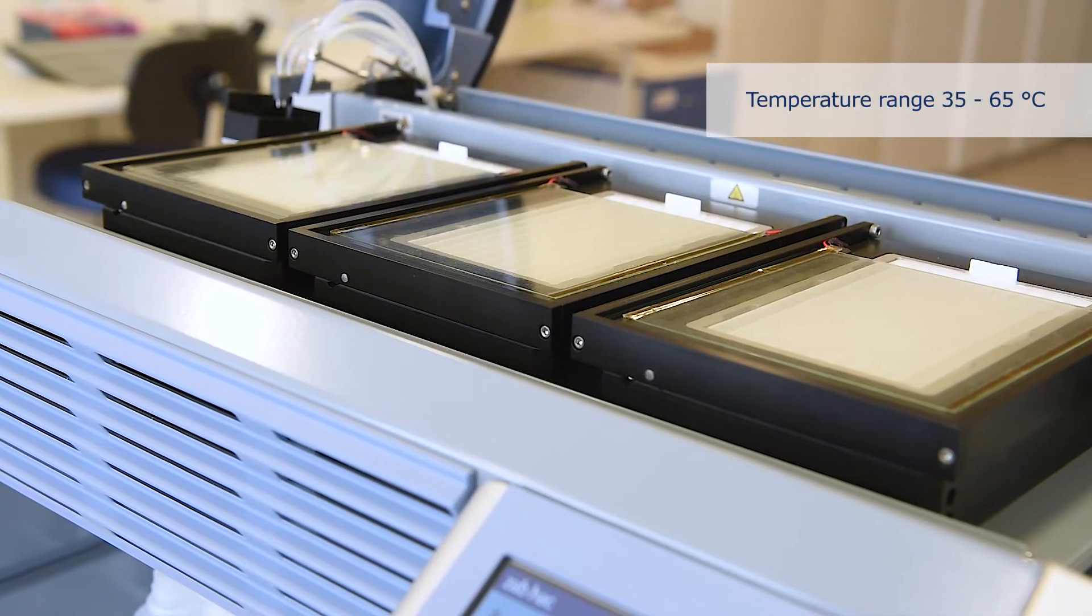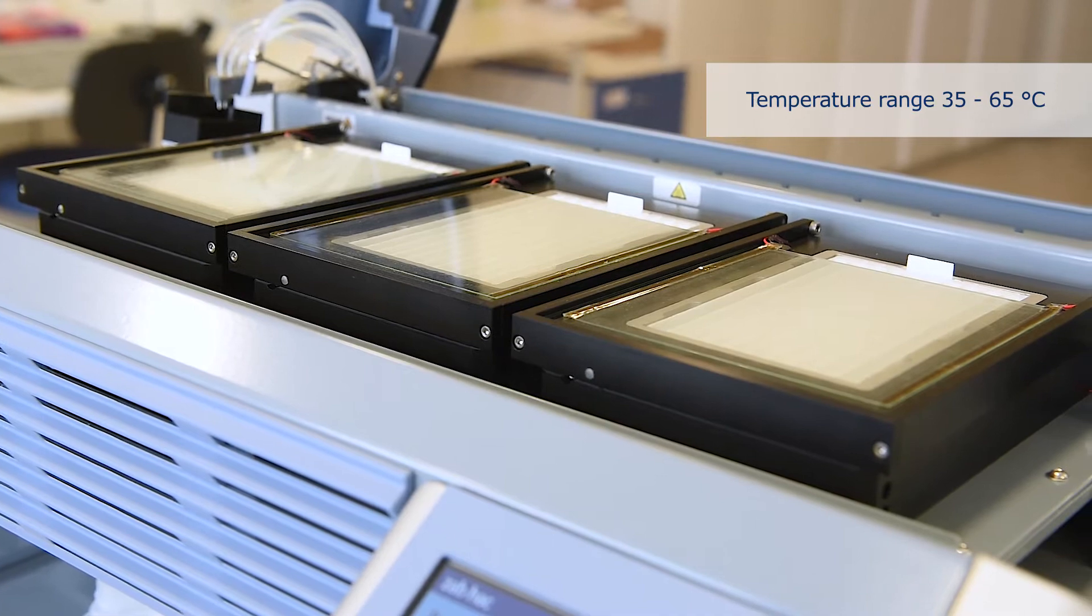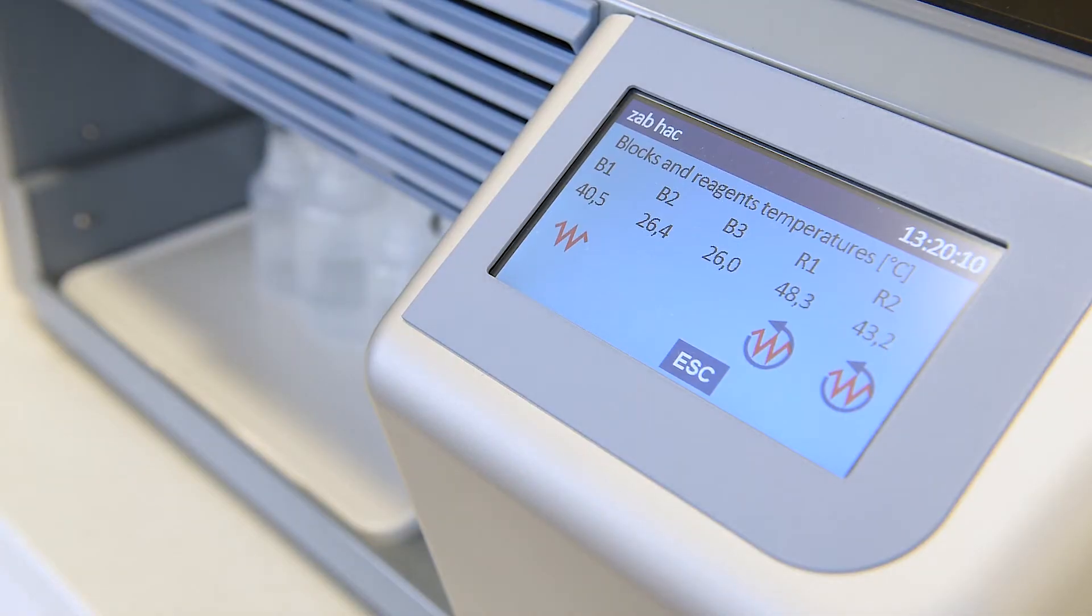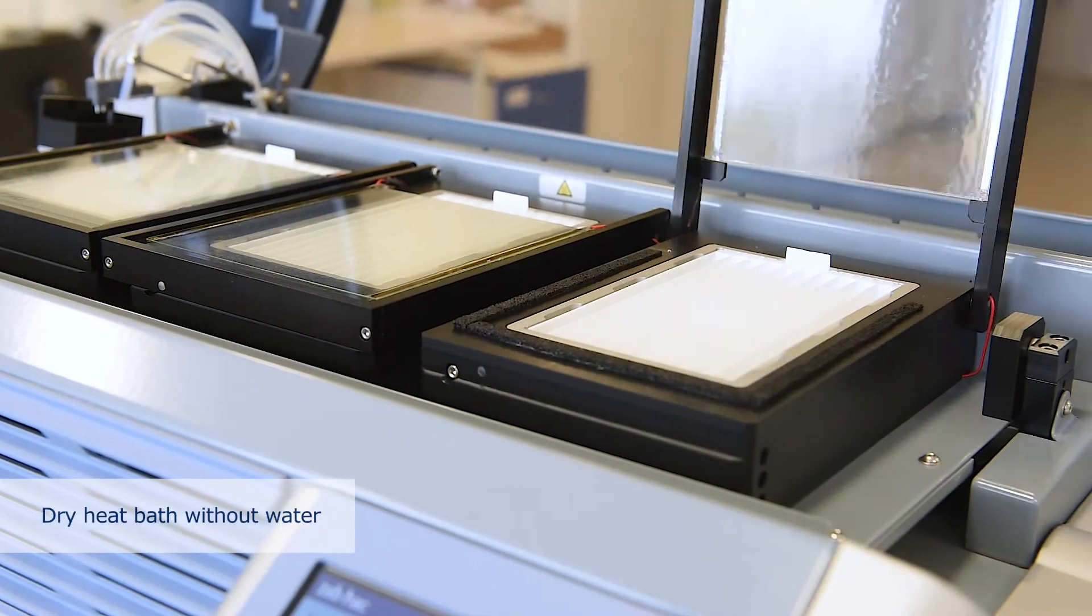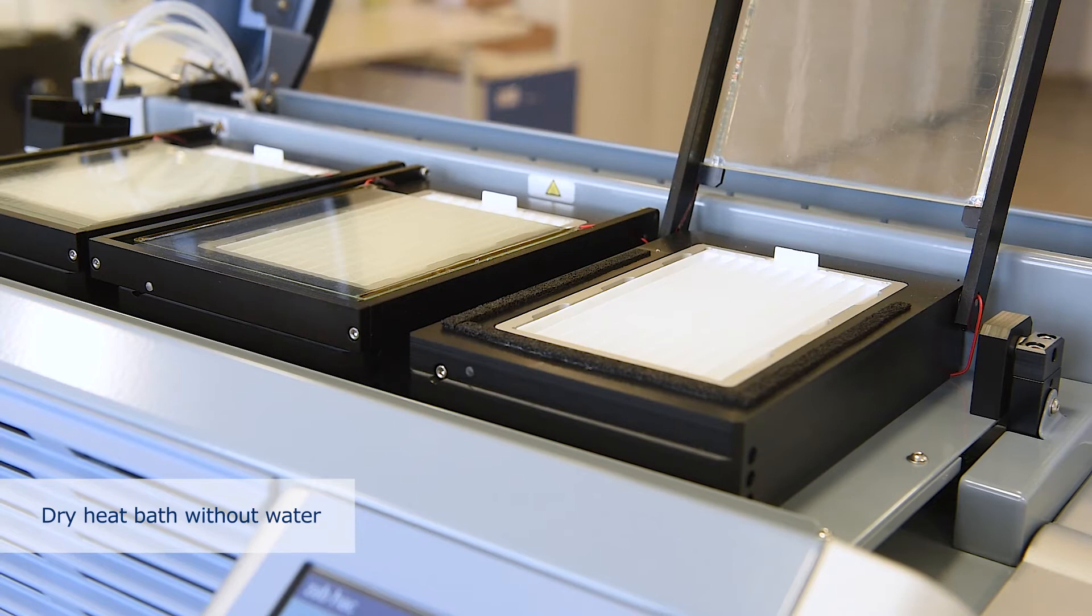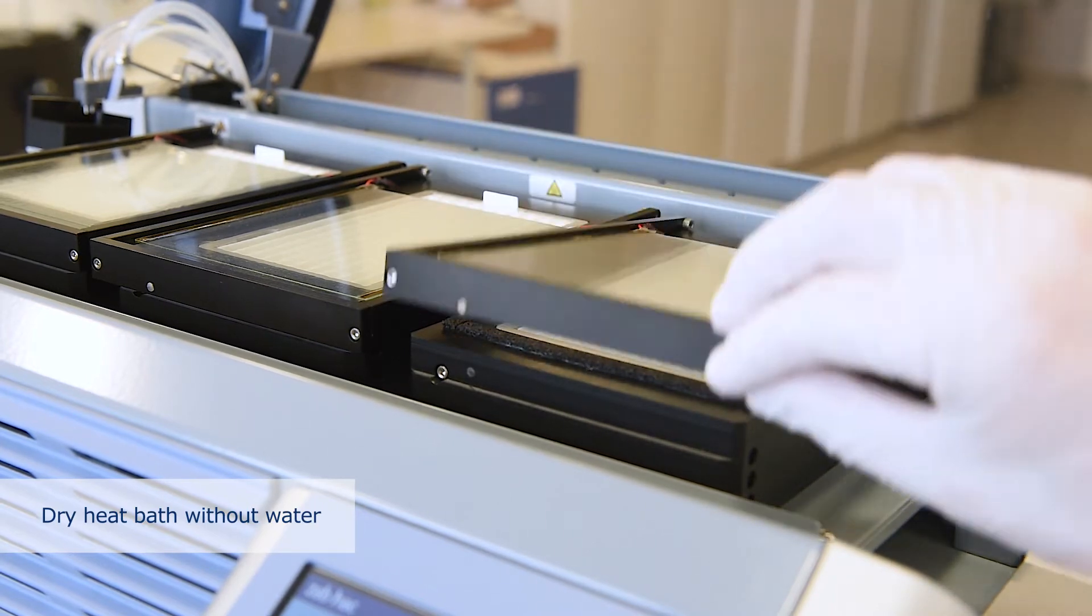As temperature control has key importance in hybridization assay technique, we've developed a sophisticated heating system which brings top temperature accuracy. It is based on dry heat bath. As it works without water, it has the advantage of easy handling and low service costs.